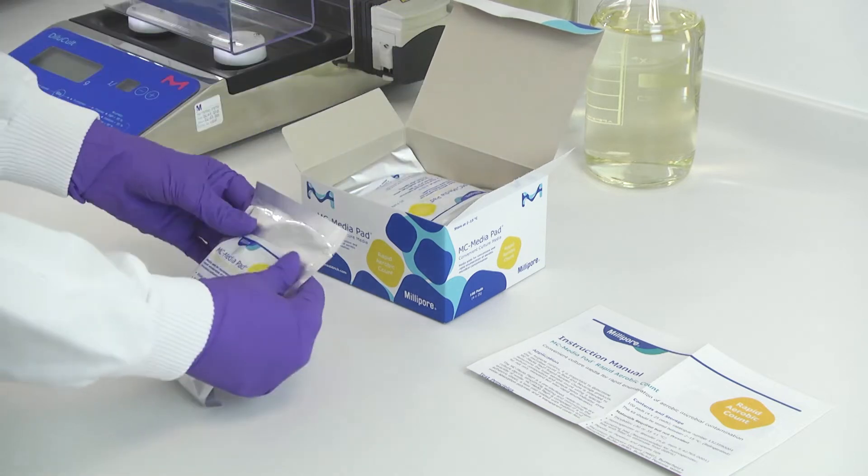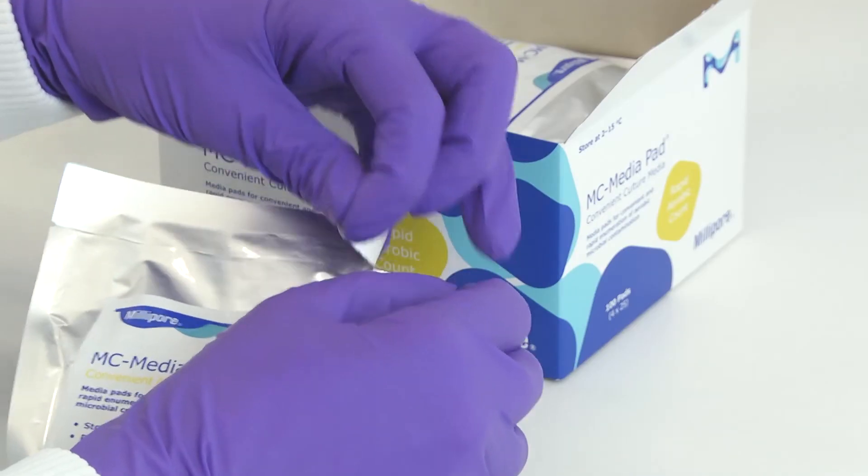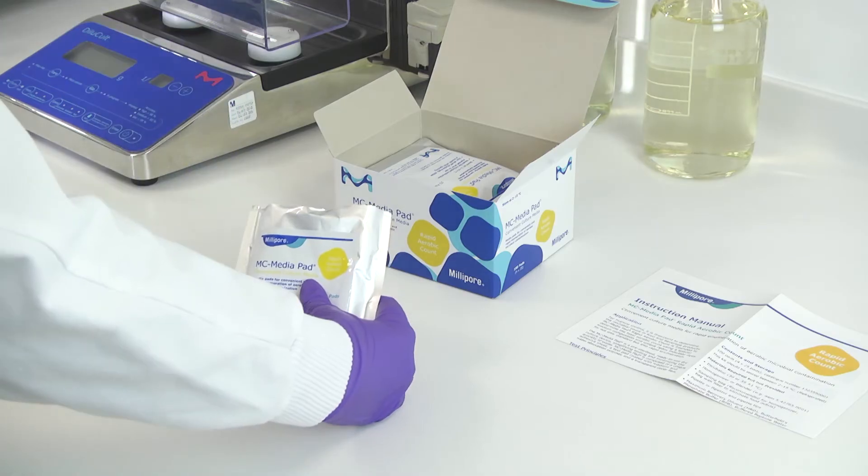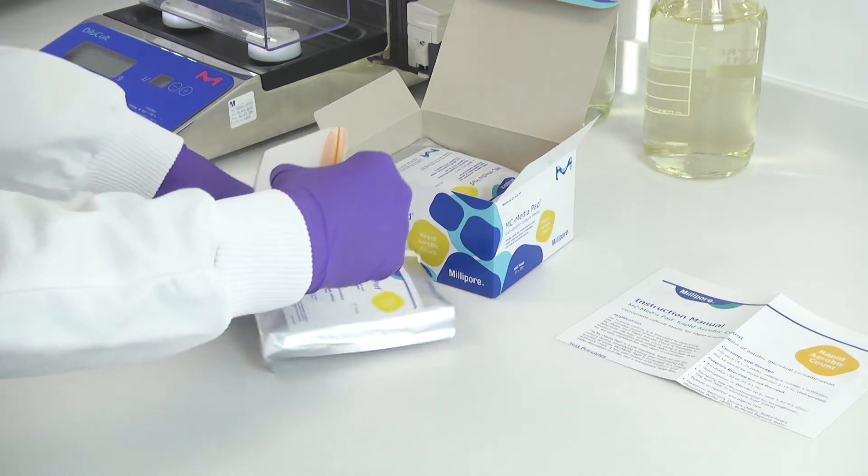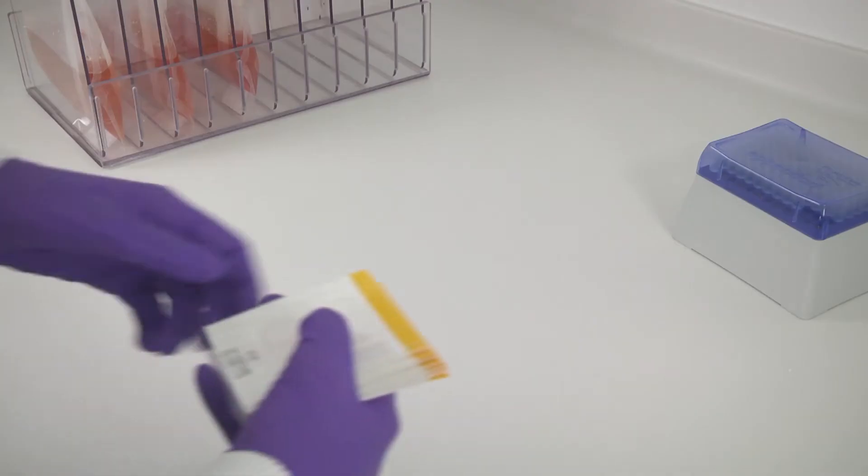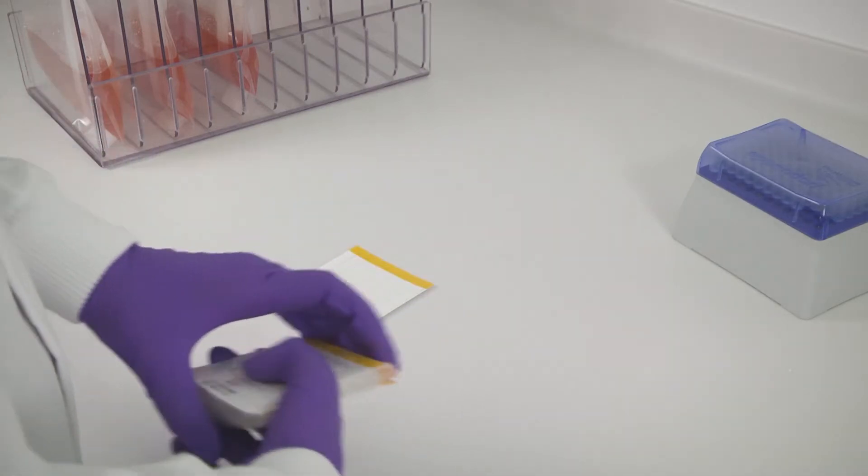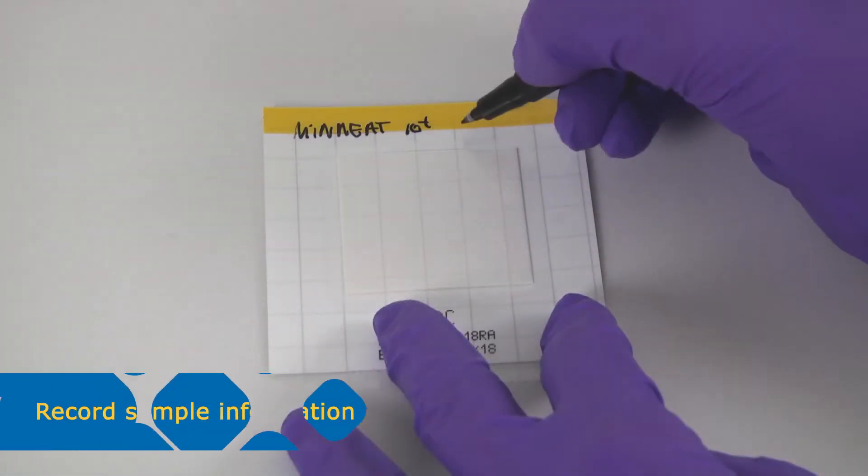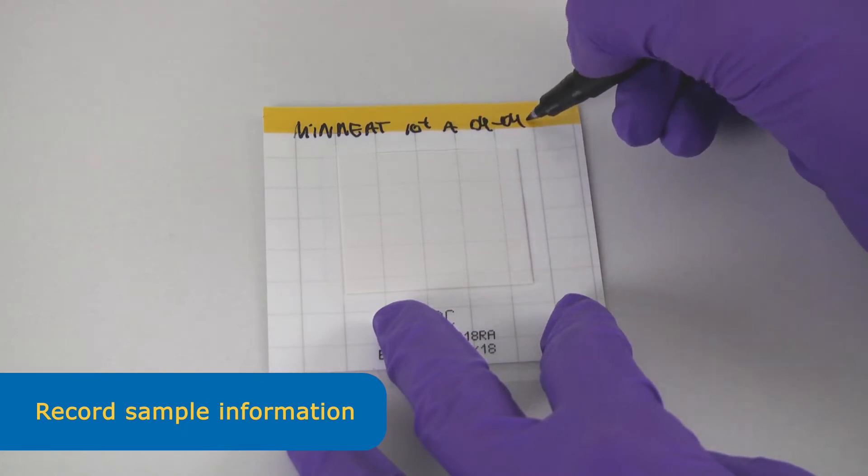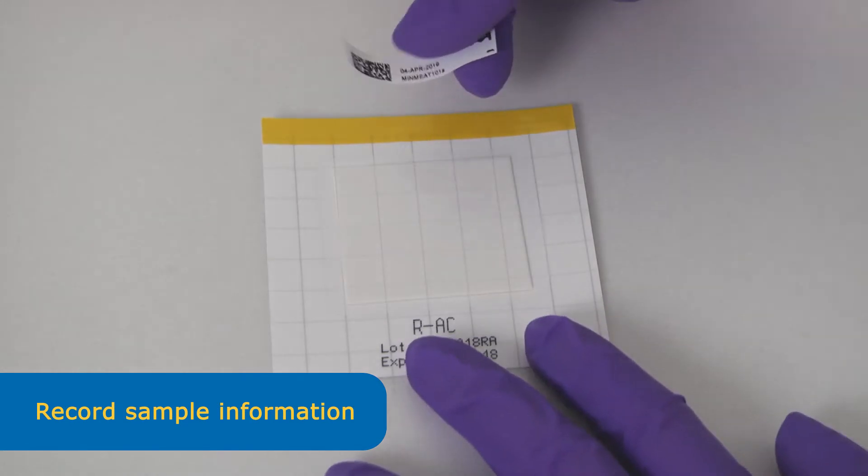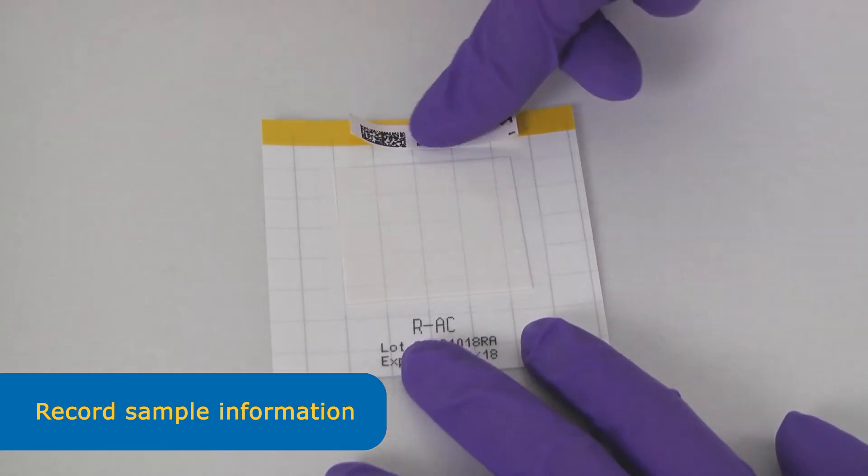The MC MediaPad workflow comprises 4 easy steps. To start the testing, take the pad out of the bag and place it on the bench. You have space on each pad to write sample information or attach an adhesive barcode label.